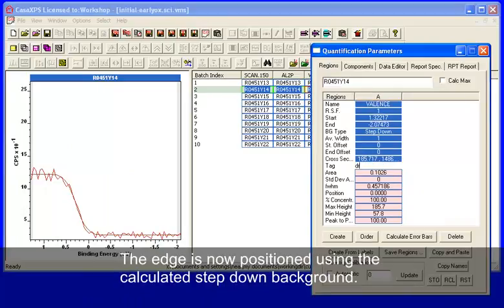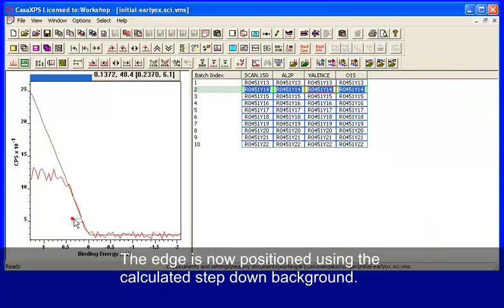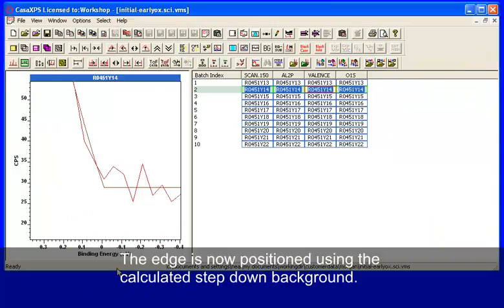You can now see where this Fermi edge has been placed. If we do draw lines again, this should be at zero, and that's confirmation that the calibration has been applied to this Fermi edge.